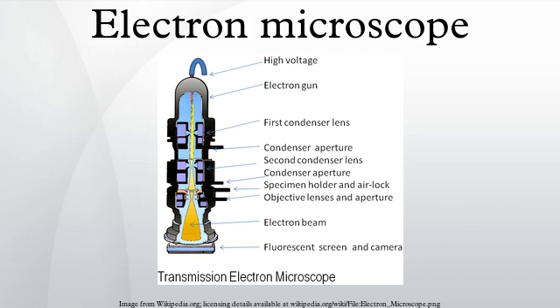The specimen is returned to room temperature and pressure, then the extremely fragile pre-shadowed metal replica of the fracture surface is released from the underlying biological material by careful chemical digestion with acids, hypochlorite solution or SDS detergent. The still floating replica is thoroughly washed free from residual chemicals, carefully fished up on fine grids, dried, then viewed in the TEM.